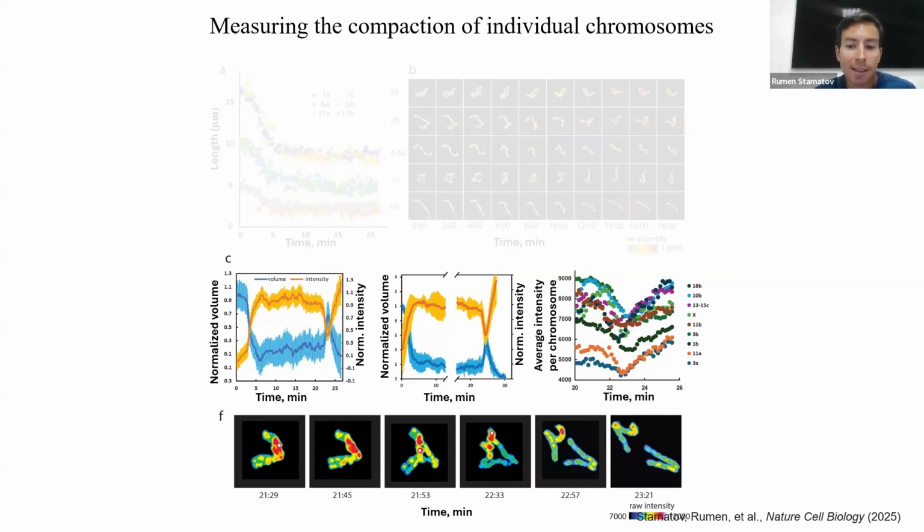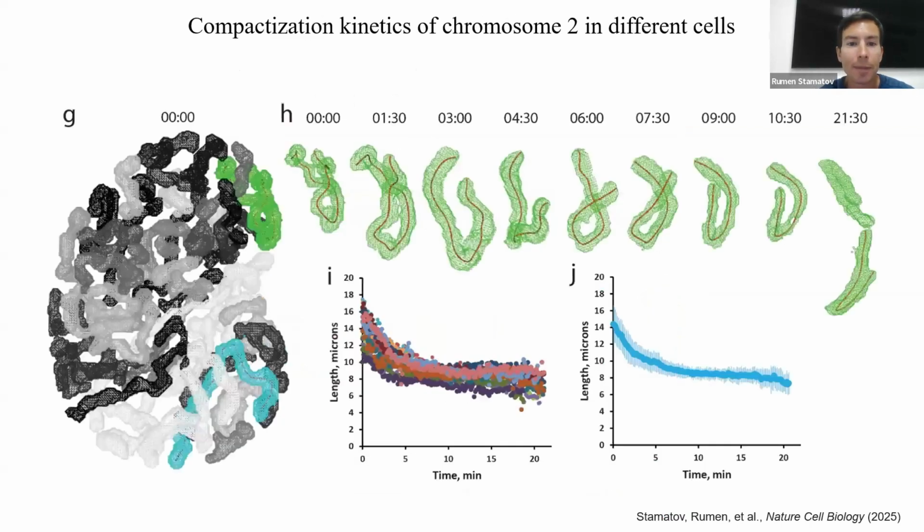So it only makes sense that they will slightly decompact at this time point, which was interesting because it wasn't observed before, at least not for human cells. I saw a paper about bacteria at some point, but it was very indirect evidence. No one had ever looked at microscopy of anaphase chromatids before in this manner. And it also makes sense because people have also used optical tweezers to extend chromosomes in vitro, and they're very pliable. It's very easy to extend a chromosome even several times its length. So I think this is a real effect, actually.